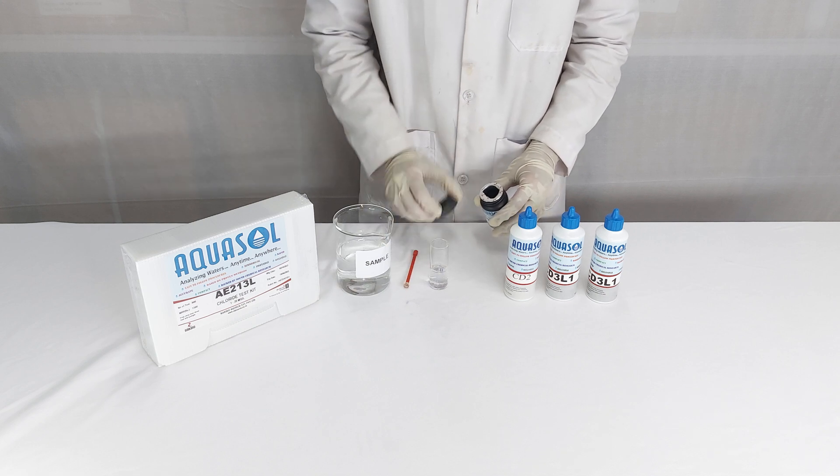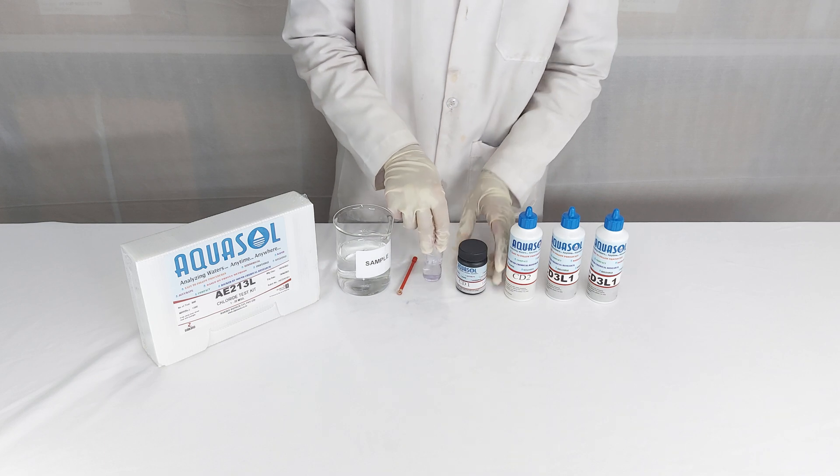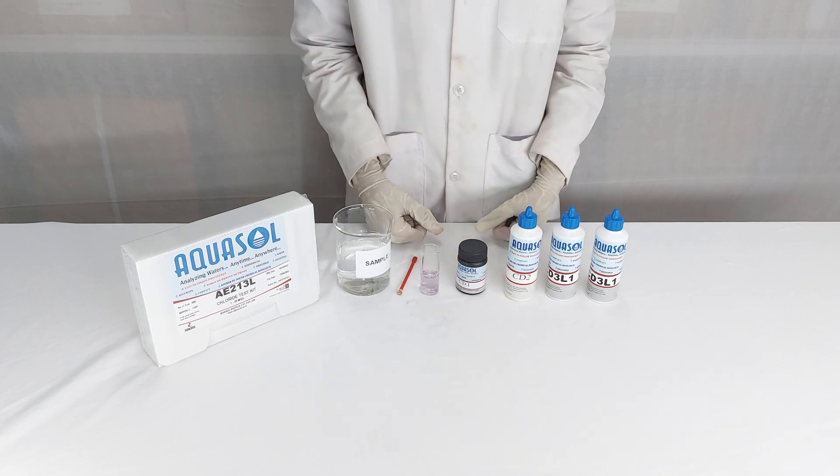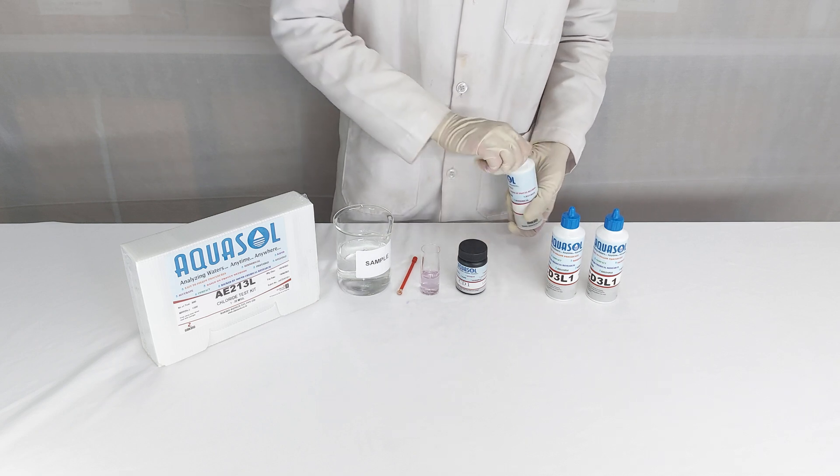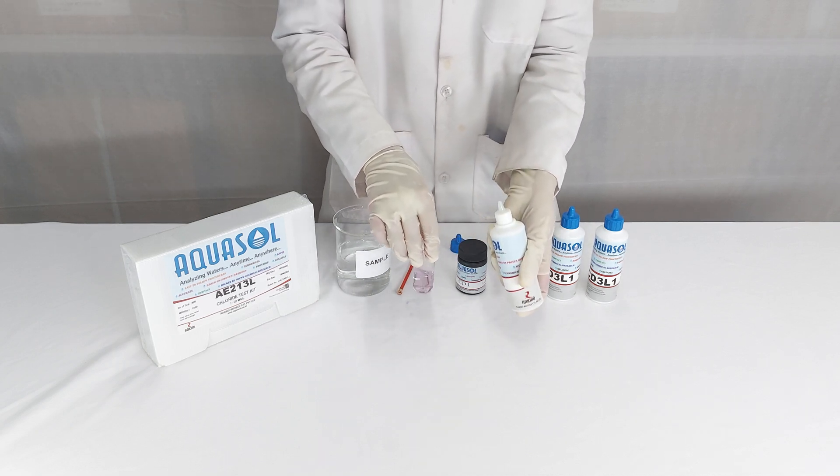Then close the bottle tightly. Mix the sample well to dissolve. Now add CD2 reagent dropwise until the sample turns yellow.